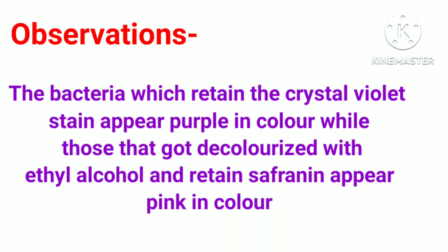The observations of the experiment are: the bacteria which retain the crystal violet stain appear purple in color, while those that got decolorized with ethyl alcohol and retain safranin appear pink in color.